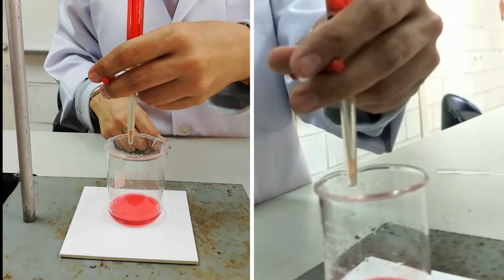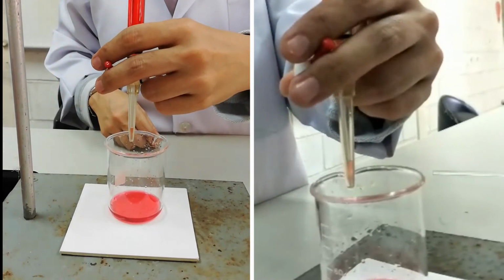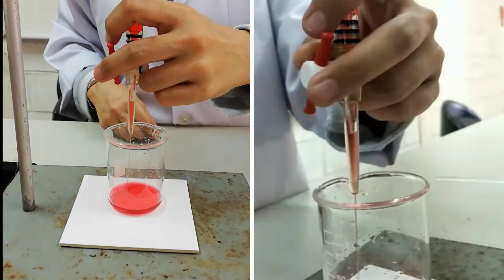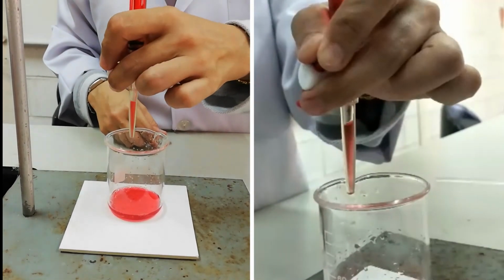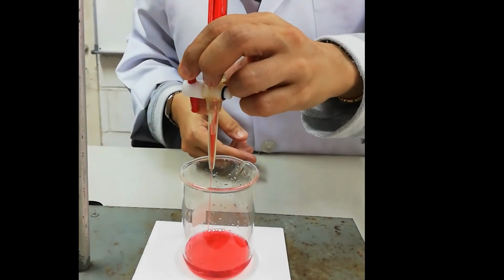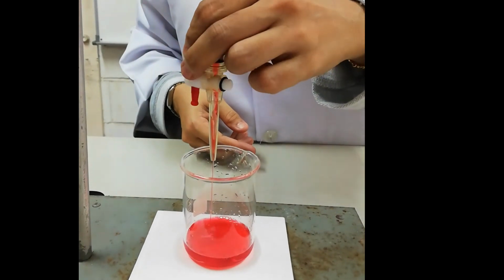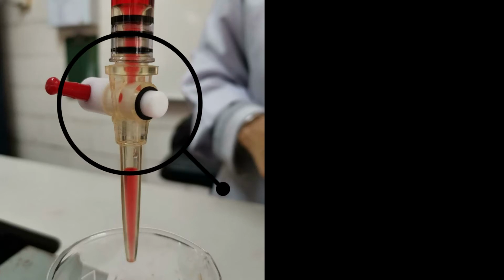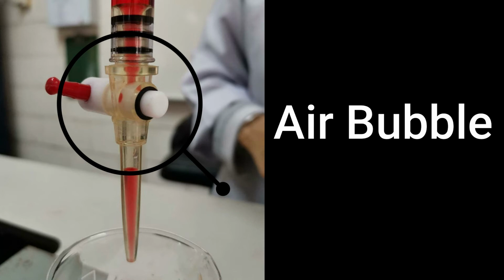Place an empty beaker underneath the tip of the burette. Turn the stopcock so that the burette tip is filled with the solution. Check for air bubbles. Usually, there will be air bubbles trapped in the tip of the burette. Remove the air bubbles if there are any.